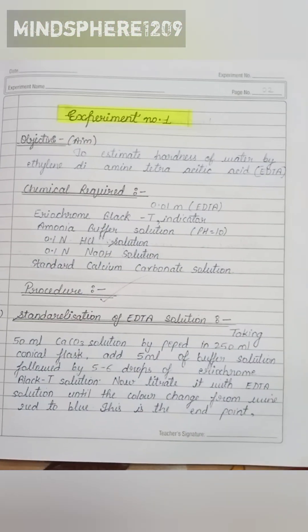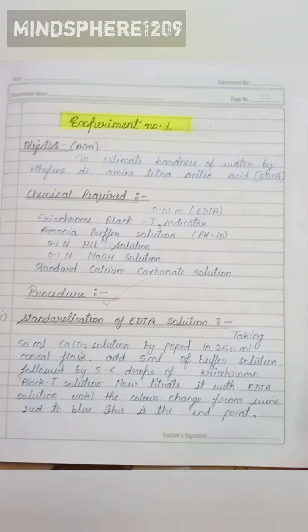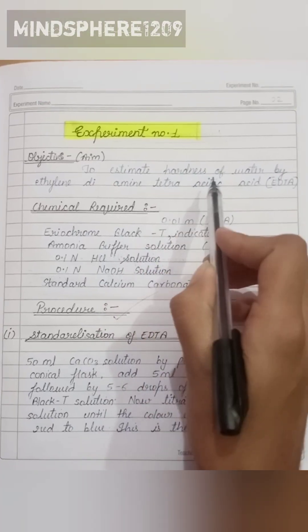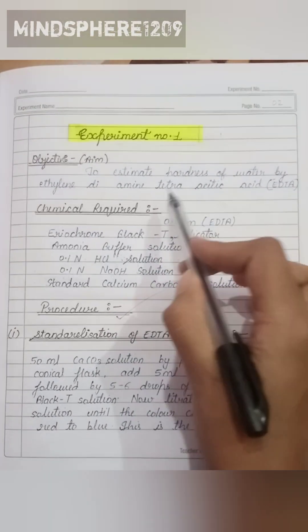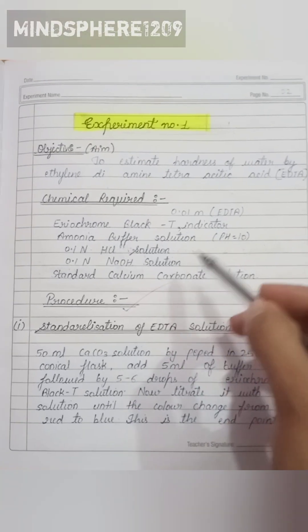Hello everyone, today we are going to see the chemistry practical file of BSC first semester. The aim of this experiment is to estimate the hardness of water by ethylene diamine tetra acetic acid (EDTA).